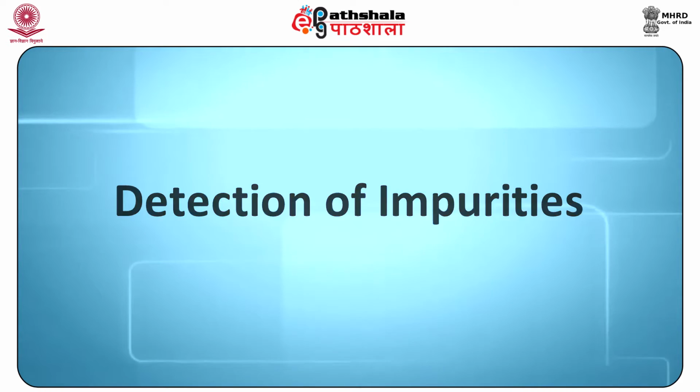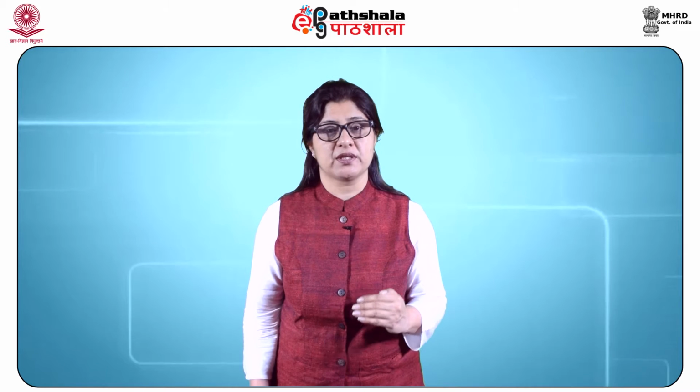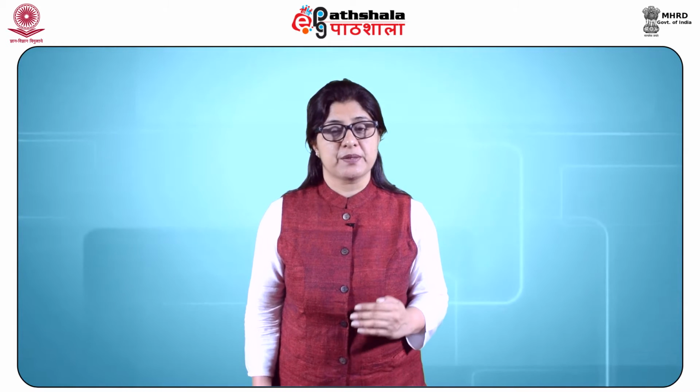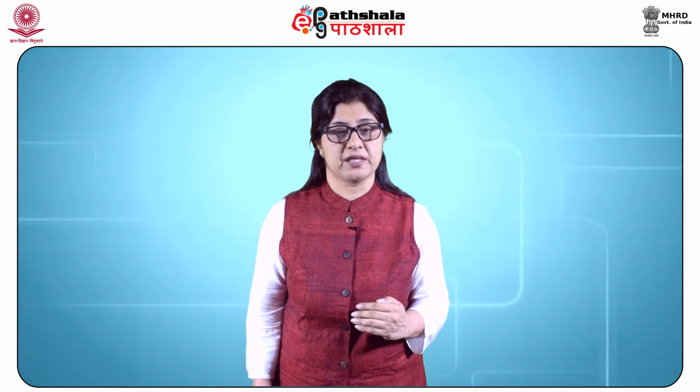Detection of impurities. UV absorption spectroscopy is one of the best methods for the determination of impurities in organic molecules. Additional peaks can be observed due to impurities in the sample, and these can be compared with those of a standard raw material. By also measuring the absorbance at a specific wavelength, the impurities can be detected. Benzene appears as a common impurity in cyclohexane. Its presence can be easily detected by its absorption at 255 nanometers.